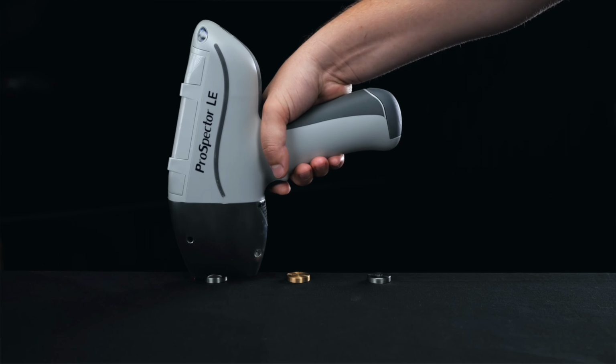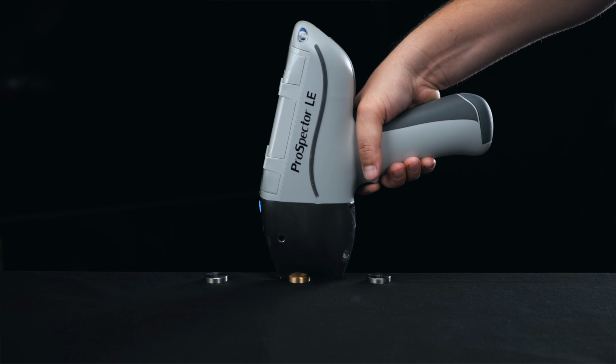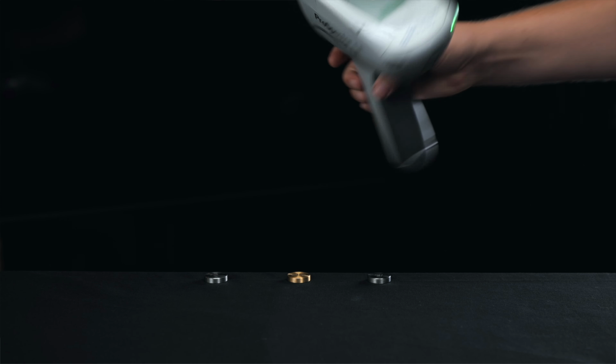Results are often compared with an external laboratory where composition is also expressed in oxides. ProSpector 2 allows you to get this oxide format without any manual calculations. The analyzer does everything for you and shows the ready oxide balance on the screen.